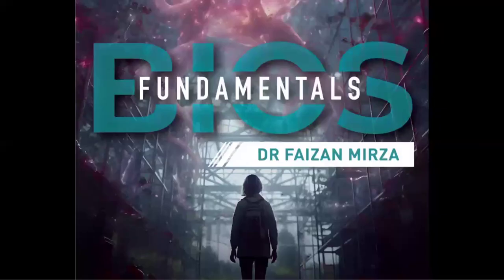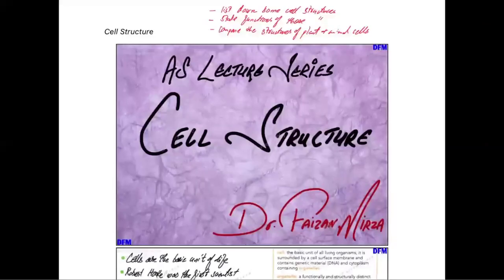Hello, students. This is Dr. Faizan Mirza. In this video, I'm discussing with you the chapter of cell structure, and the structure that we'll be covering basically here in the first part of this video will be the microscopy. So let's start with this.